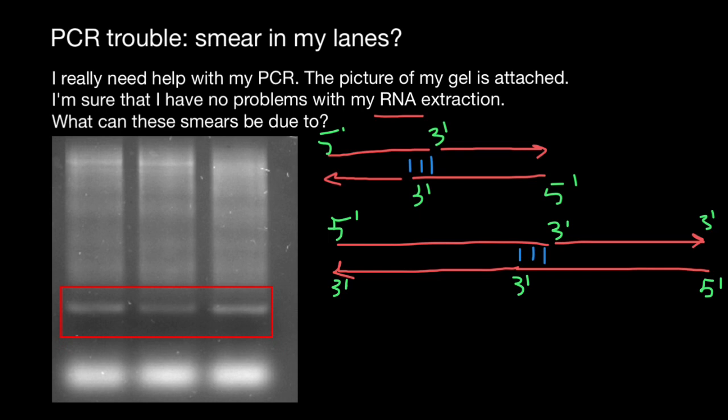My final advice: try adding a good positive control and negative control, reduce the concentration of primers, clean up your gel electrophoresis equipment — don't forget about the comb — and also include a size ladder. Hopefully next time you're not going to see smearing like this.